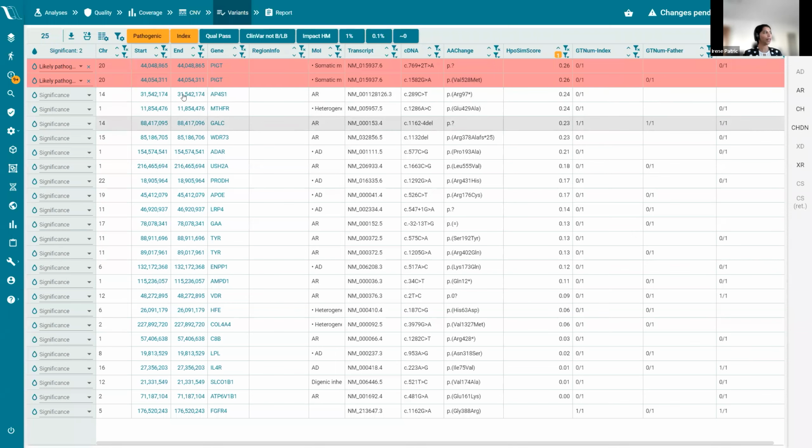But now I would like to show you a little about the report basket. When I apply certain filters, I would also like to save the steps of filtering. So this is why the report basket is there, that now I say whatever I see in this view, I would like to save it to the report basket so that I know what filters I applied, what is the result I saw, and how I went about my filtering steps.